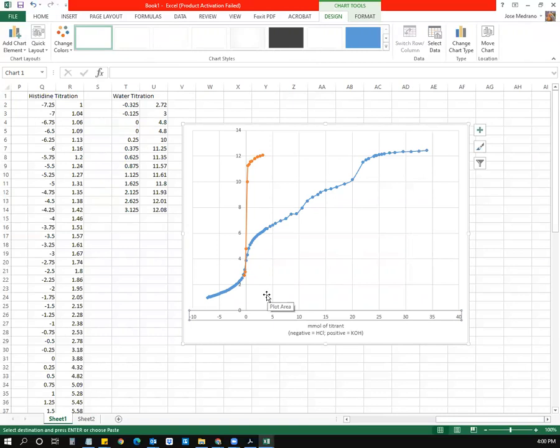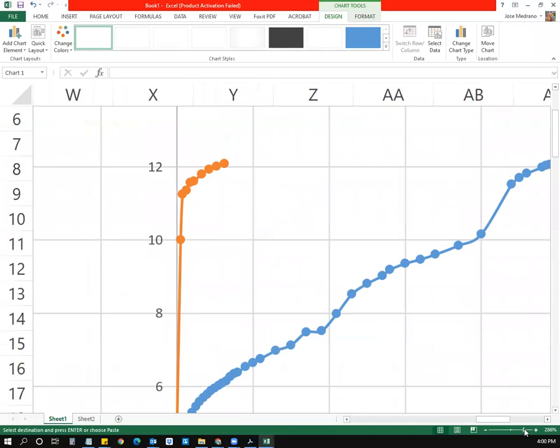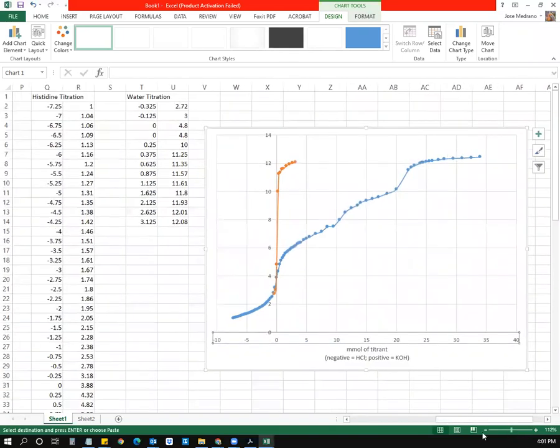So what I am looking for is something at around pH 7.25 for the blue histidine curve. Now that is going to be in this area over here. Now, the thing is, I probably shouldn't be zooming into the graph, and there's only so much zooming in that I can do on Excel before essentially I can't estimate any further. At the same time, if I zoom in far enough, I might be able to see one axis but not the other, and that's just going to defeat the point of getting a good estimation.